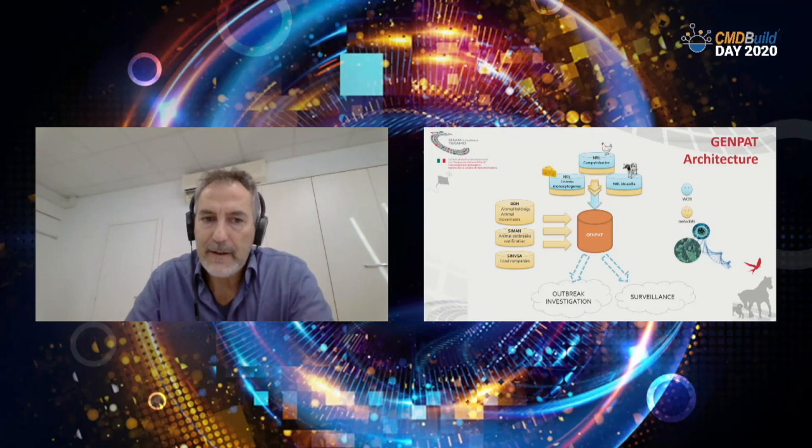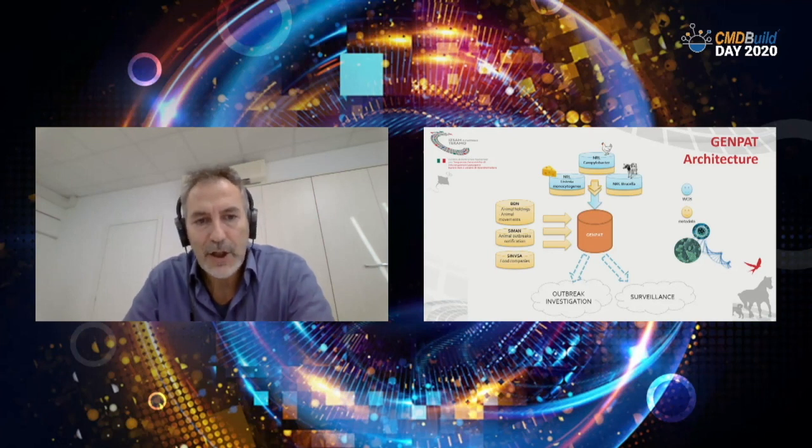An important part was the harmonization of those data, and also the harmonization of the methods, because we might have different methods for different pathogens. I have put cheese, chicken, and cows just to describe the main matrix, the host where these kinds of pathogens can be taken. Listeria is common in cheese, Campylobacter in chicken, and Brucella in cows.